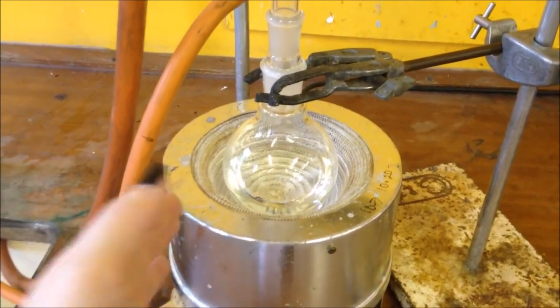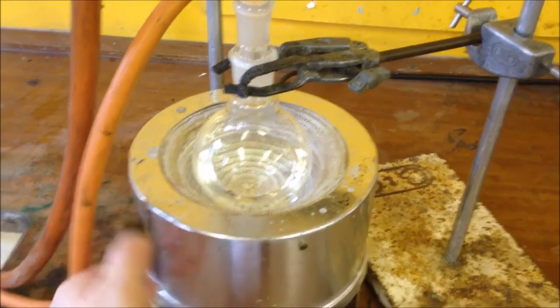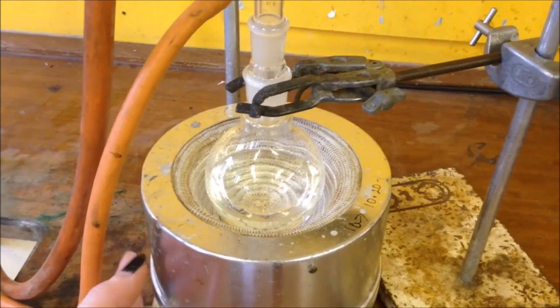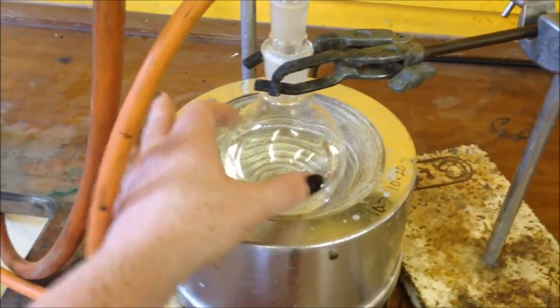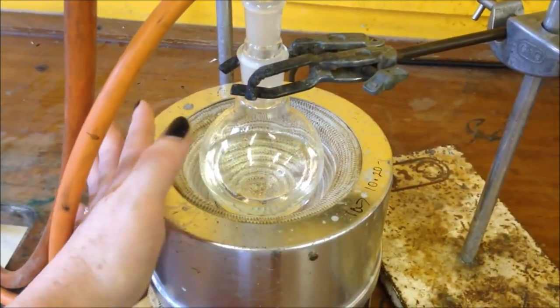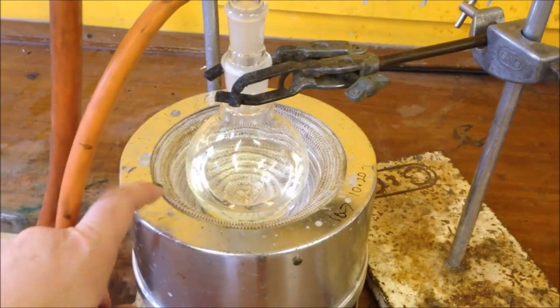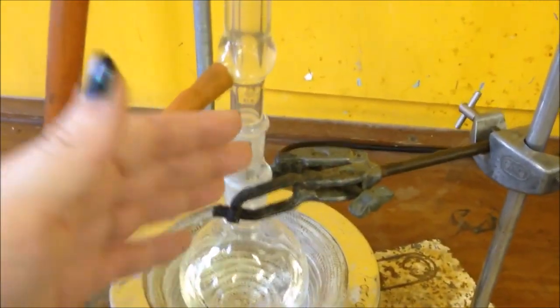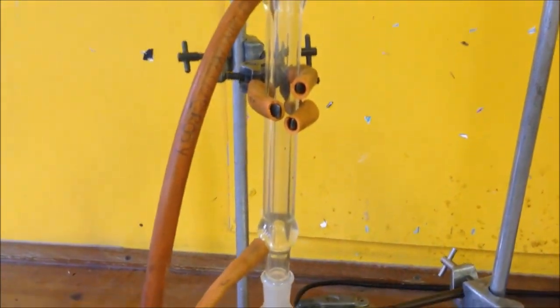After mixing all of those things I've set it up to reflux. Here I have my mantle. You could use a Bunsen burner or a water bath if you don't have one of these available. Here's my round bottom flask. This is just sitting ever so slightly above the basket here, so it's not sitting on it. I've got my connector and I've got my reflux condenser here.